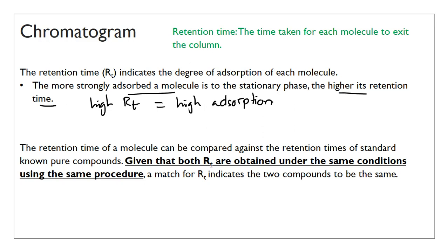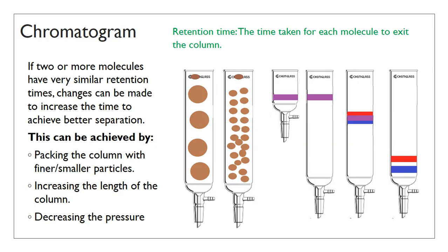Okay, so this also requires that the retention time of the standard and the retention time of the sample are obtained under the same conditions using the same procedure. So that's standard. So if you have a standard, then you want to make sure that when you analyze a sample, the same conditions are being adhered to. All right, so that's retention time.